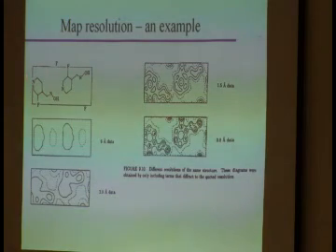Now, if I actually had my structure, for example, from NMR or from protein sequencing and other knowledge about what kind of protein peptide sequences usually form helices and stuff like that, if I was really forced to, I could probably get something that at least approximates this model, right? Because this is obviously the bigger ring, and so this has to be the side chain. What I wouldn't be able to tell is whether this is the side chain of that ring or of that ring, okay? But I could still do some kind of placement there if I knew exactly what my atomic connectivity is.